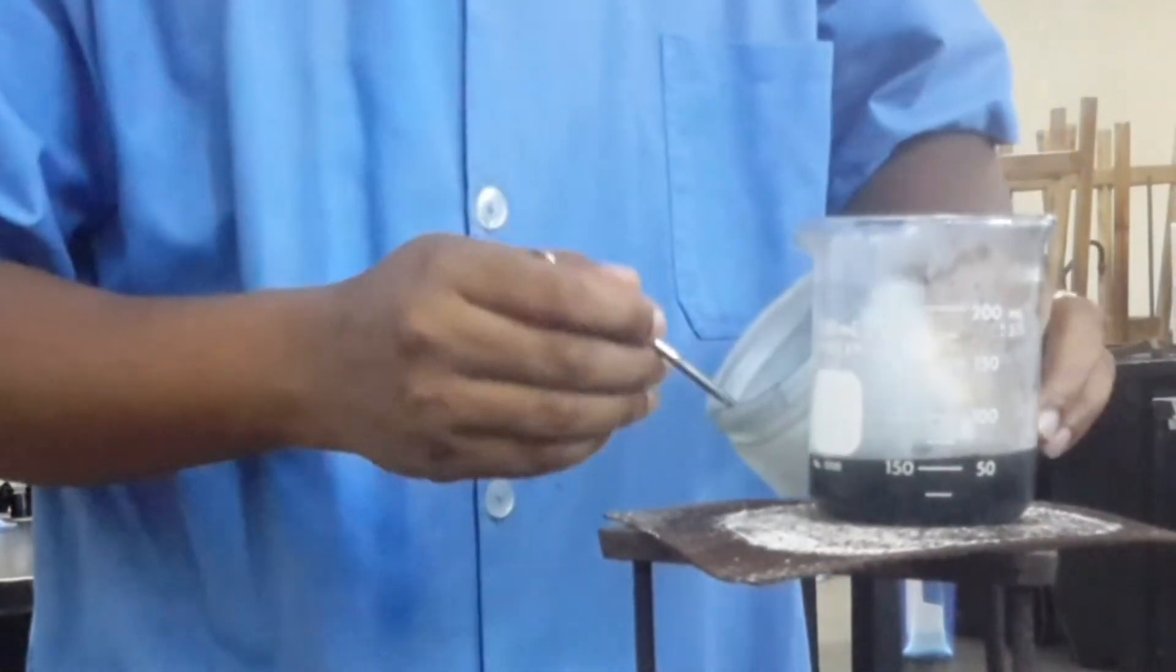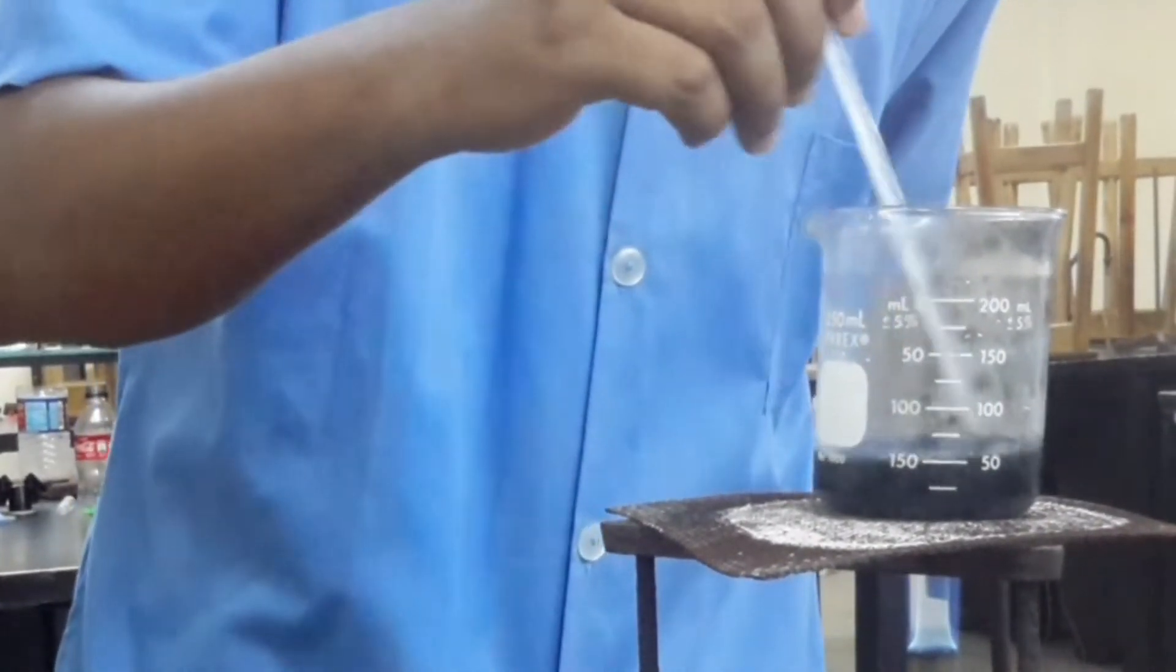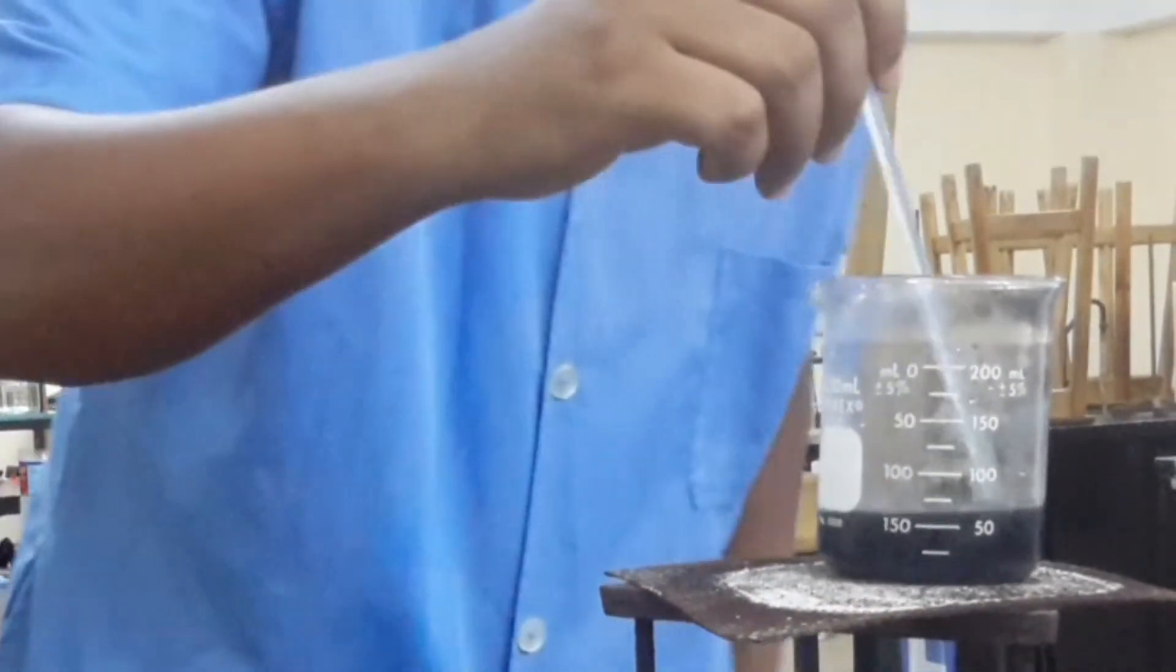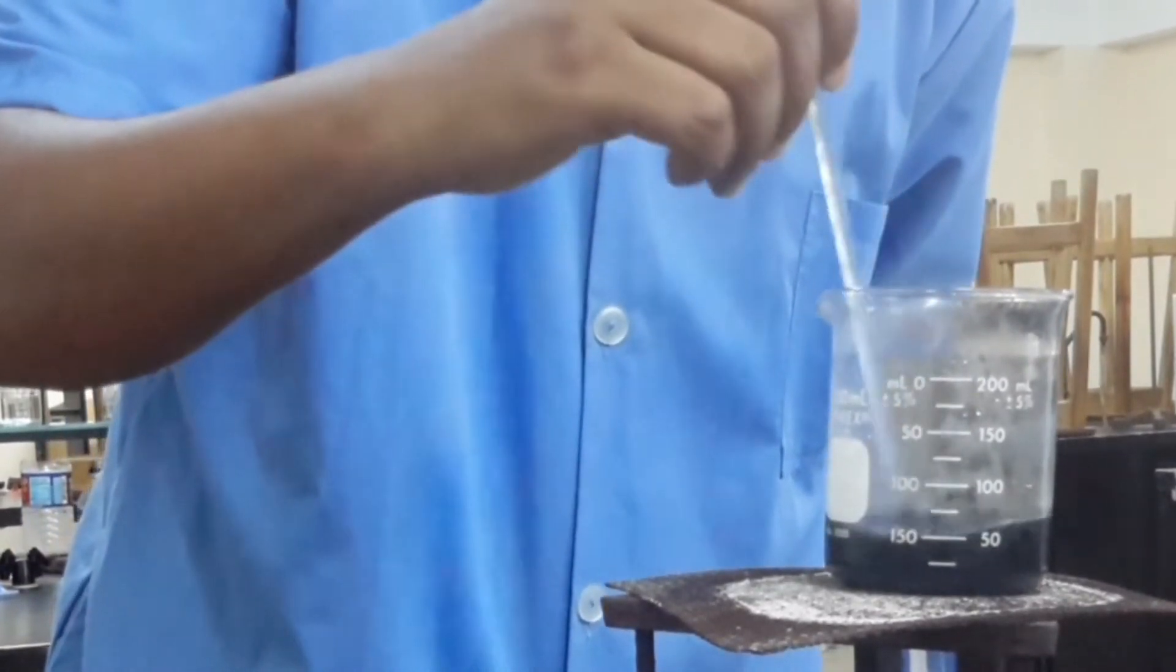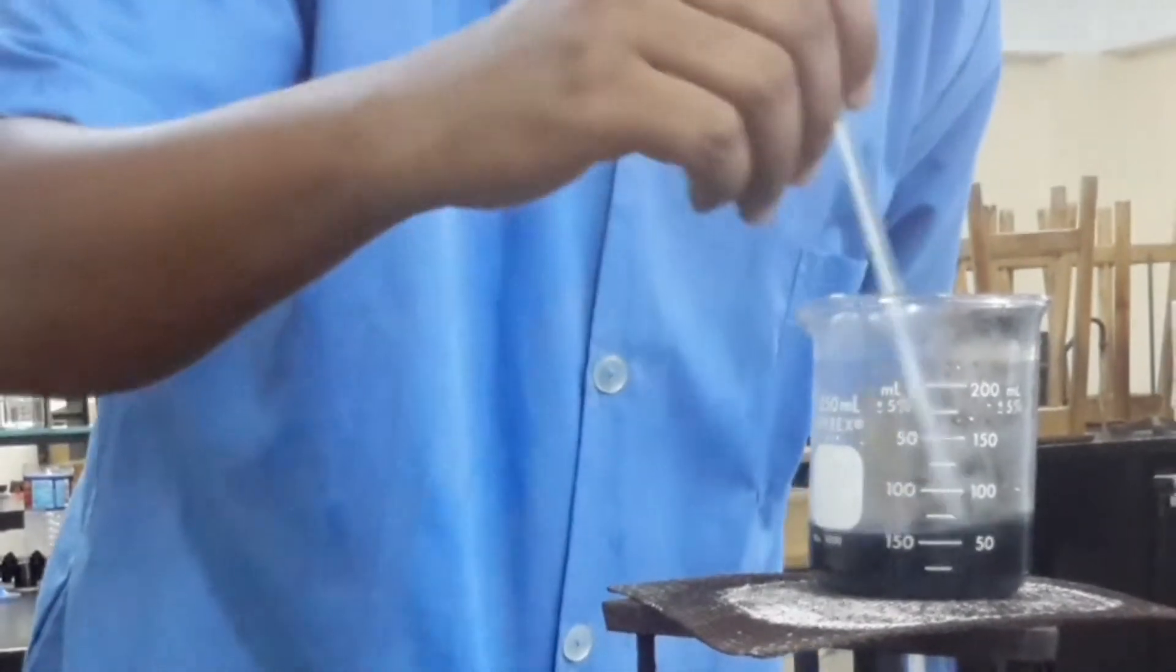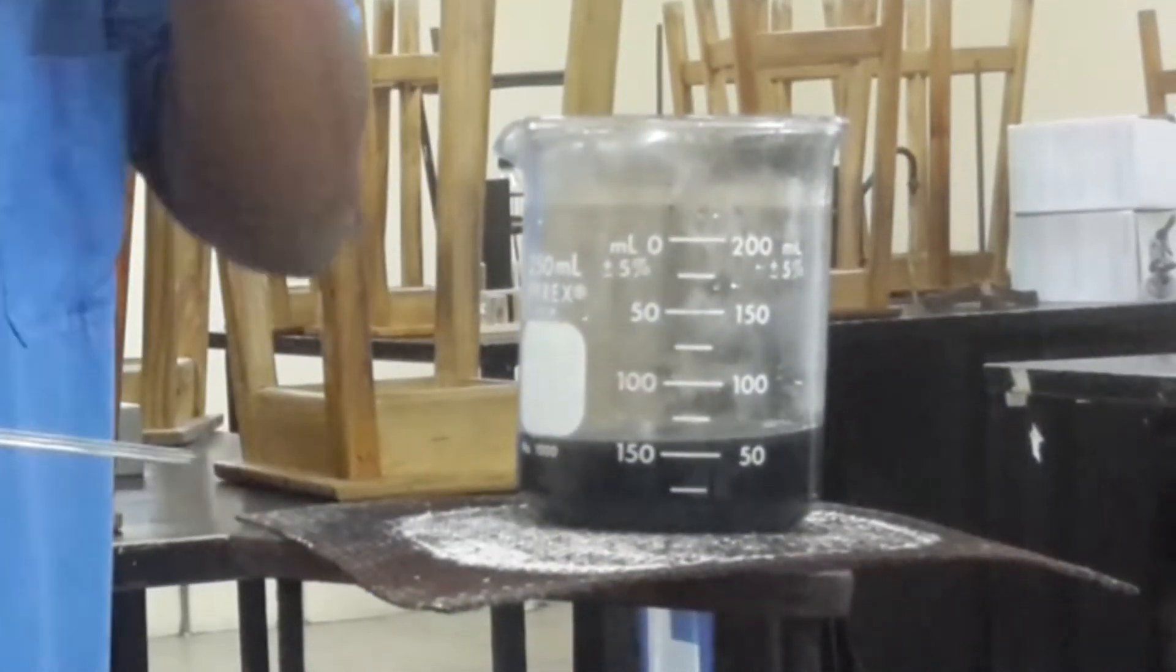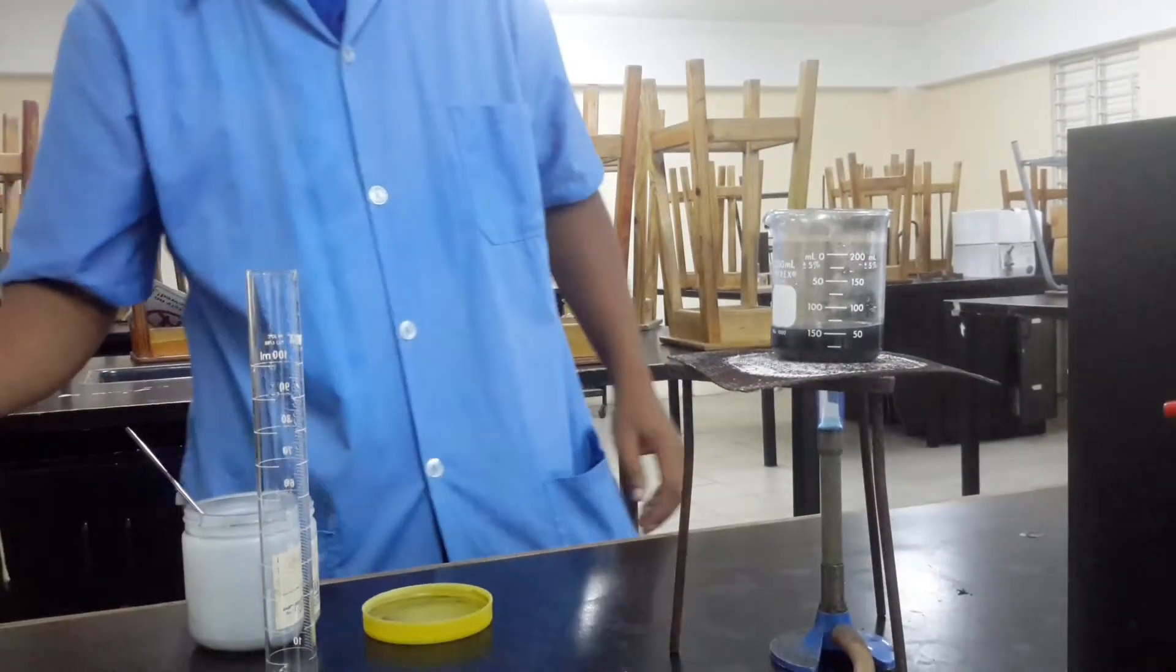That was one, two. And we want to ensure that we have copper oxide settling at the bottom of the container. That's when we know we would have added copper oxide in excess. I believe it is looking like it's settled.